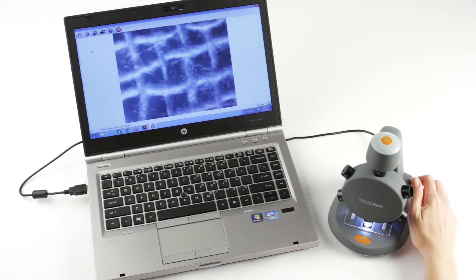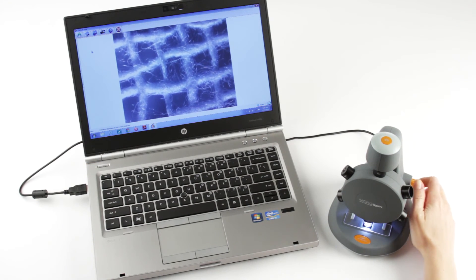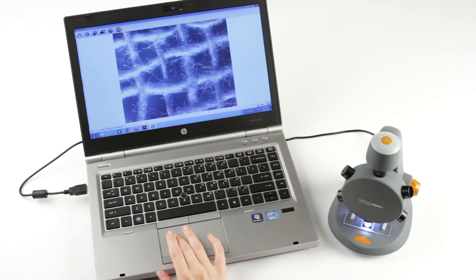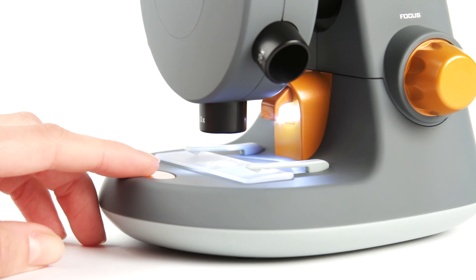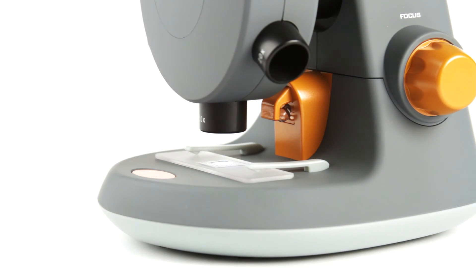A great microscope for students, hobbyists, and professionals alike, Microspin makes it easy to save images or video to your computer's hard drive and drop them into other programs. Upper and lower illuminators accommodate both 3D objects and microscope slides.